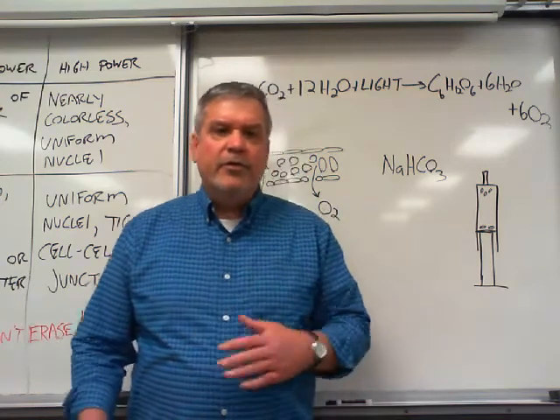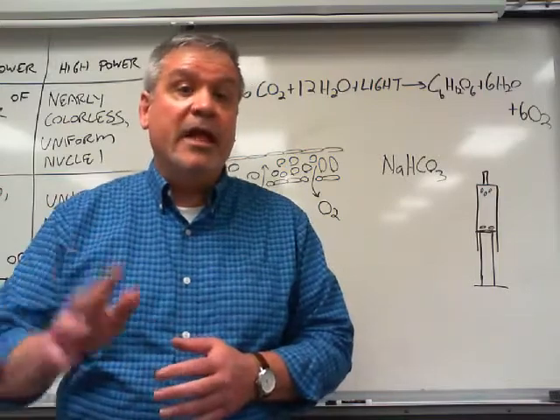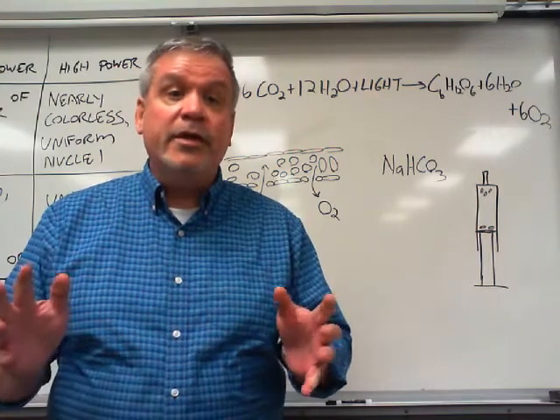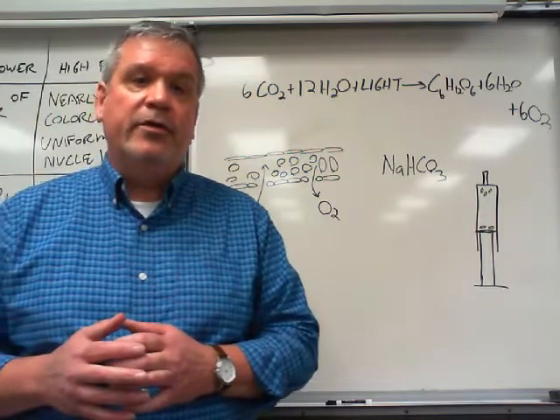Well, hello everybody. This is Dr. Neary back again with a short video about the second exercise in lab number 5. And that's a photosynthesis exercise. Specifically, this is a floating disk assay looking for photosynthesis.